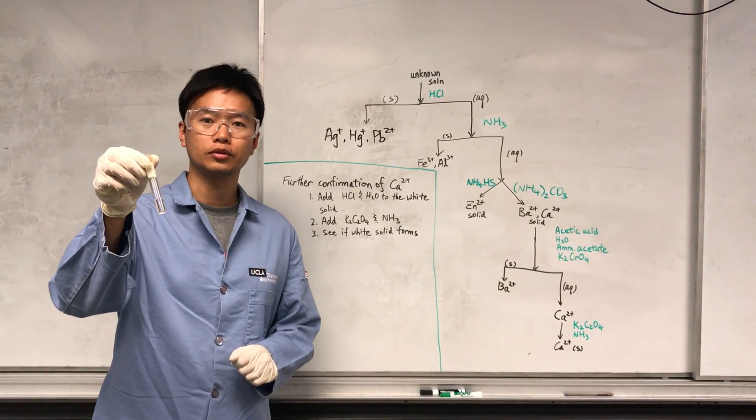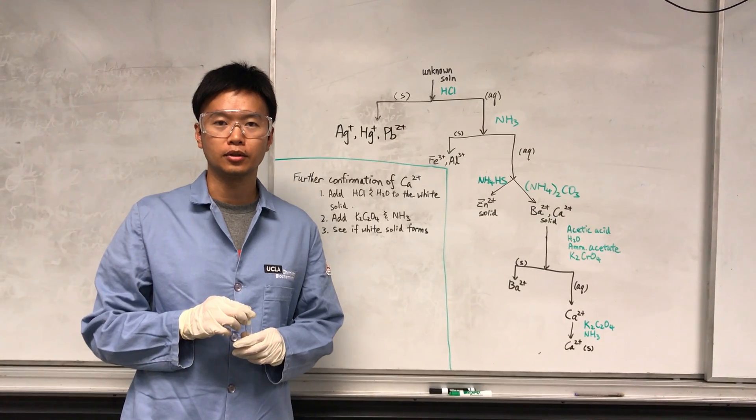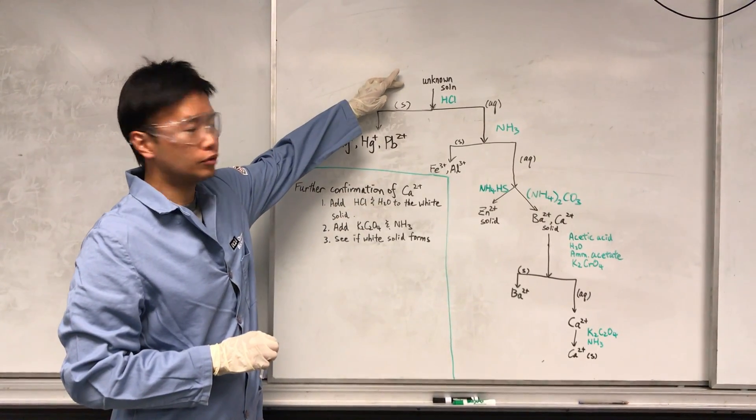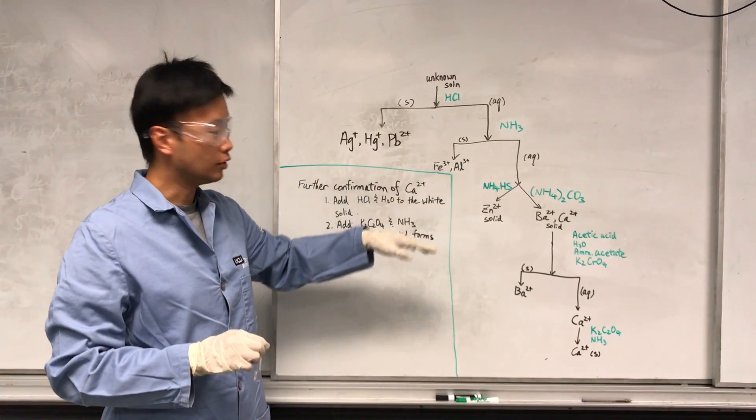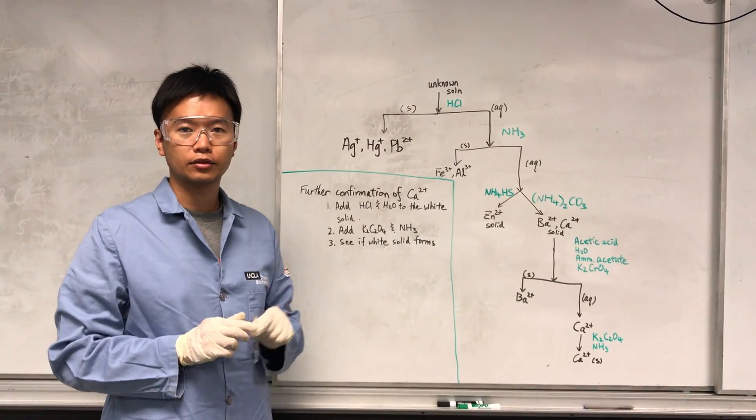Okay, so I have a metal cation solution in the test tube, and I'm going to test what kind of cation is in this particular solution. So what I'm going to do is go through a series of tests. Hopefully I can identify the metal cation inside this test tube.